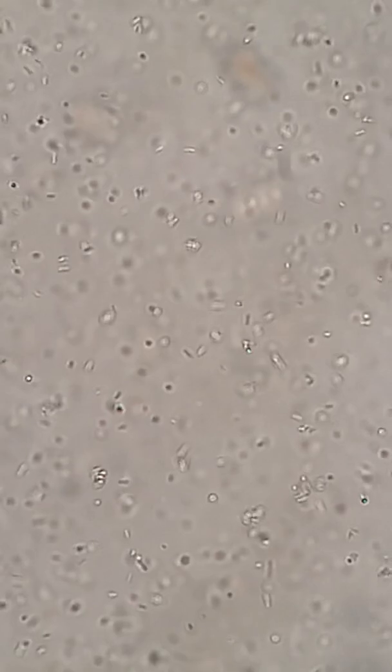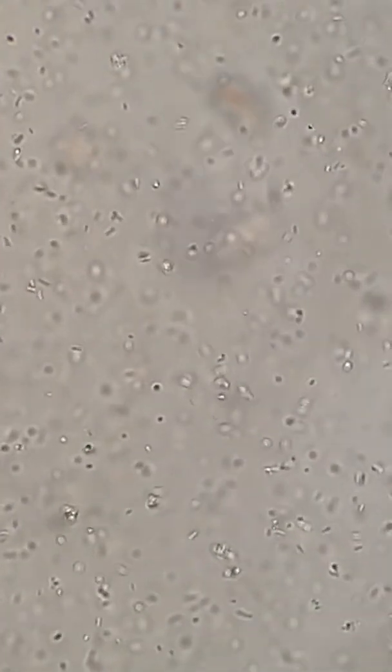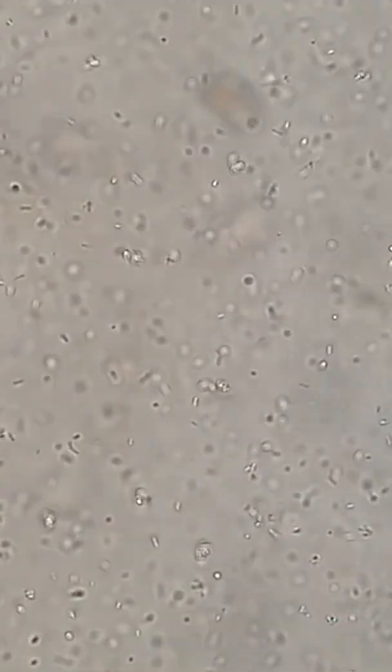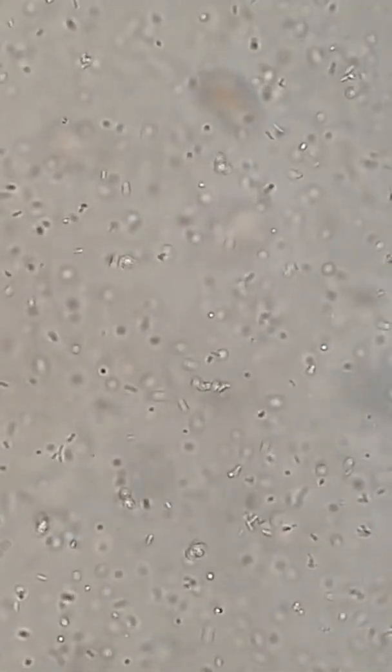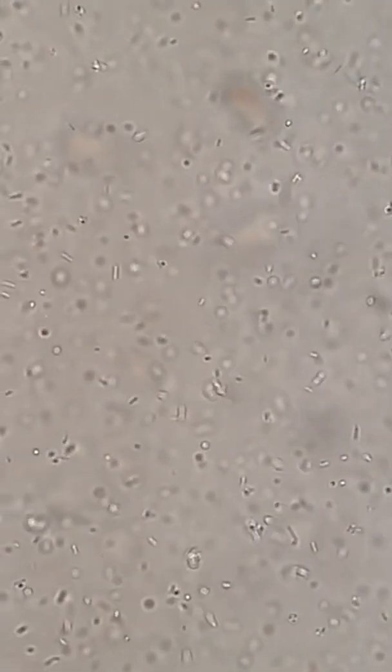So you can see the different types of bacteria in here. So personally, would I take this? Yes, I actually did already and I would take it again. I think it's my personal opinion that I feel like it is worth the money if you're looking for a probiotic pill supplement. I would get this personally.